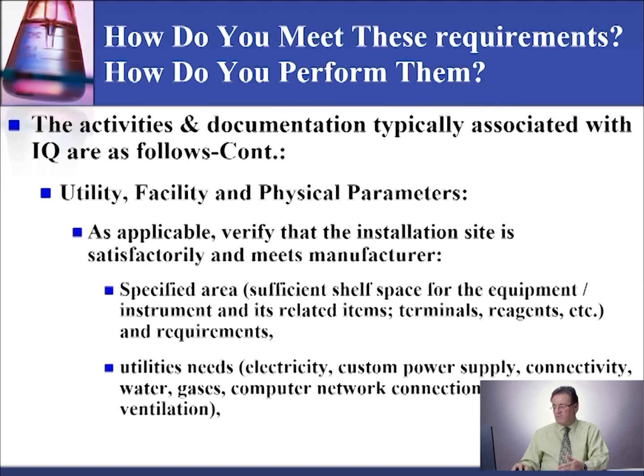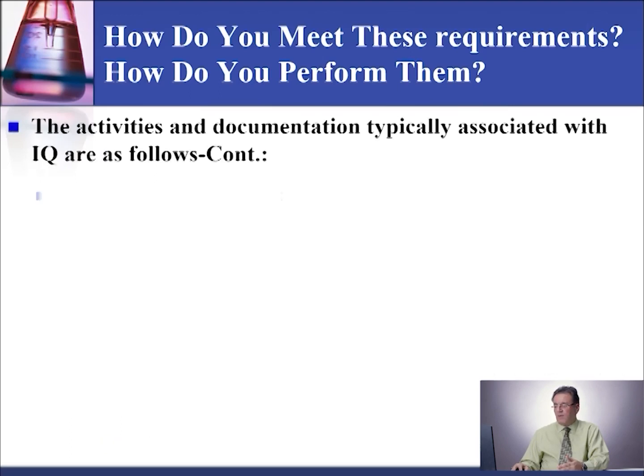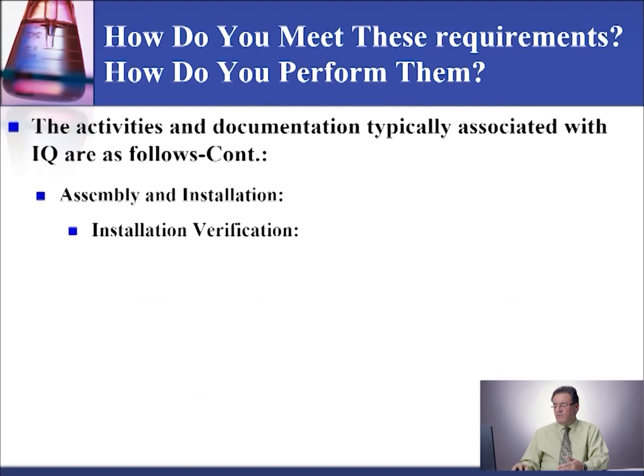Instrument equipment performance verification includes a process to verify that the instrument and the equipment perform according to expectation for the intended use and within defined tolerance limits.